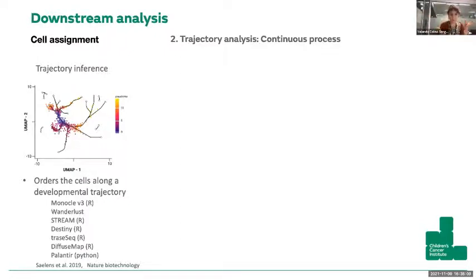developmental pathway. And for trajectory analysis, you can either do unsupervised, where you just take all of the differential genes that you have, and it orders your cells based on those differential genes between what is like, oh, this cluster is similar to this one, and then that one is more similar to that one, and then like that. So basically on a line or in a branch.